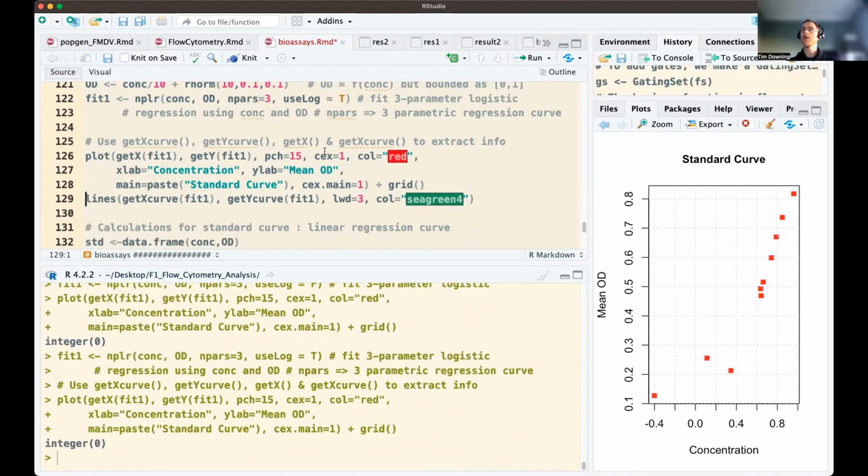what you find is that the data is kind of shaped differently because it's now log scaled. And I'm not sure for this data that we need to do that because there's already a decent spread on it. So it doesn't really make sense to do that for this data because it's less easy to interpret.